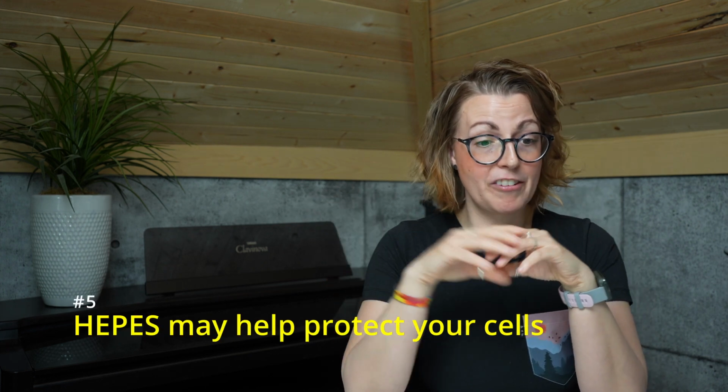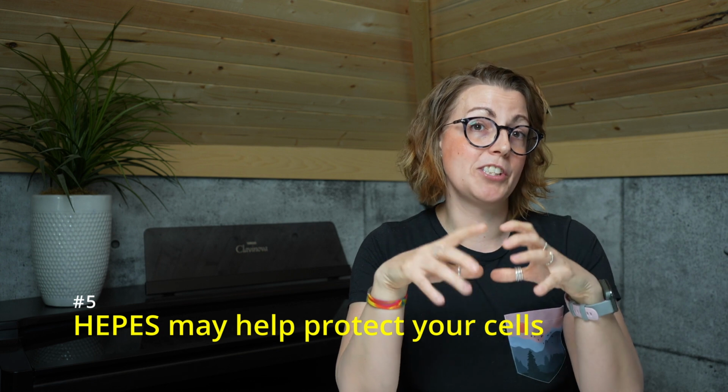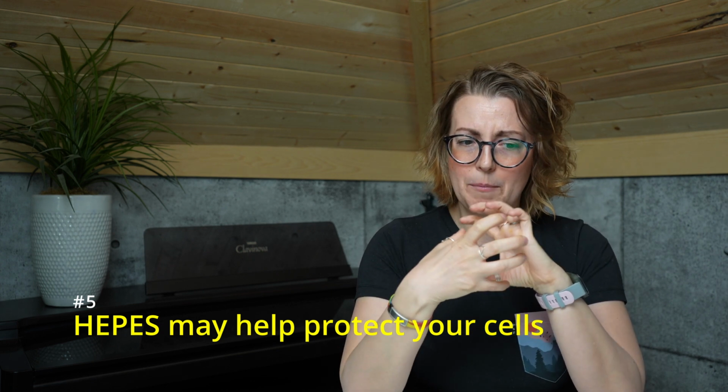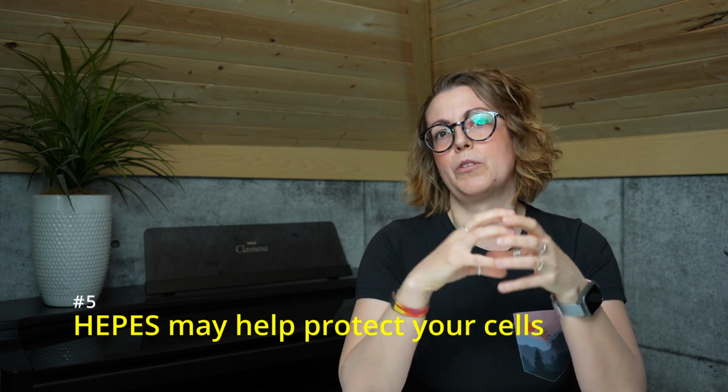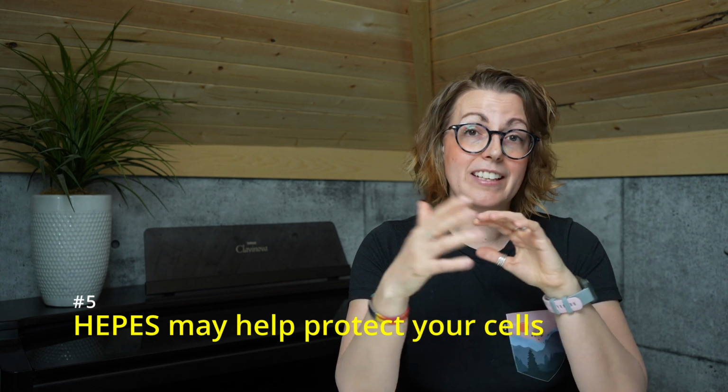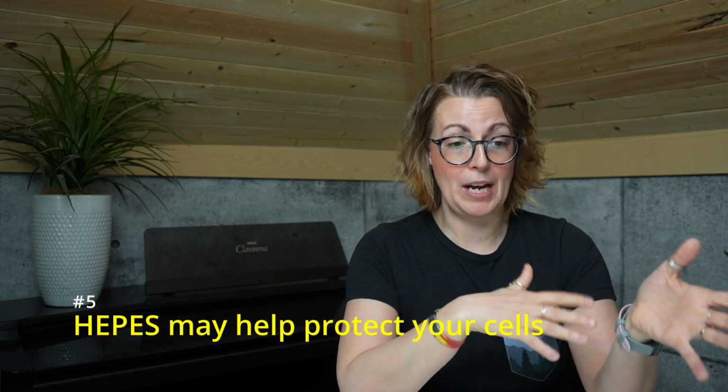Number 5, adding HEPES, again linked in the buffer video, can also be beneficial in sorting. HEPES seems somehow to shore up the cell membrane and keeps them a little bit more robust and protected during the sorting process. And this can help you maintain some post-sort viability.